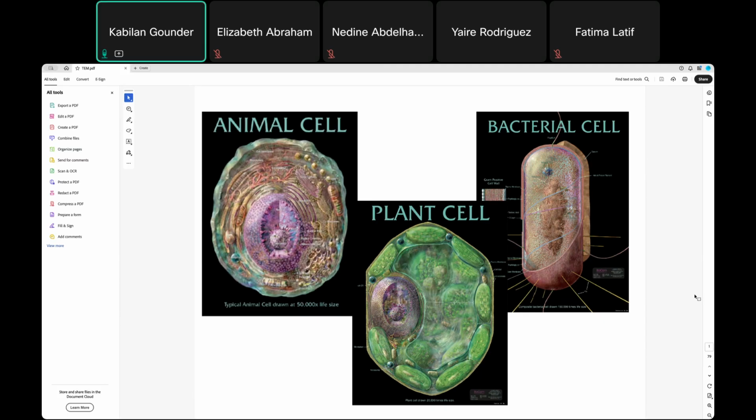the scanning electron microscope. The electrons do not penetrate the sample. Instead of penetrating the sample, they interact with the sample and bounce back. That's why you get surface images. Similarly, with the stereo microscope, you get only the surface image, because the light source is only on the top.